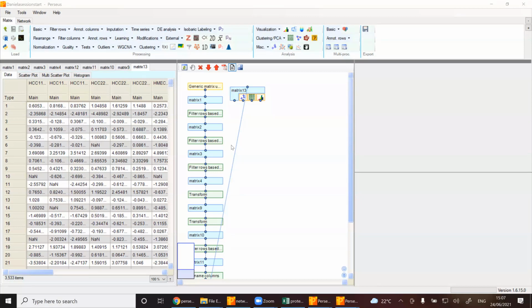You have to do that in MaxQuant in the raw data section. For example, if the reference channel is the 11th plex, you will select in set reference channel 11, just the number 11, so that MaxQuant will recognize your reference channel and apply the normalization afterwards. Then you will see the results in the MaxQuant output, specifically in the protein groups.